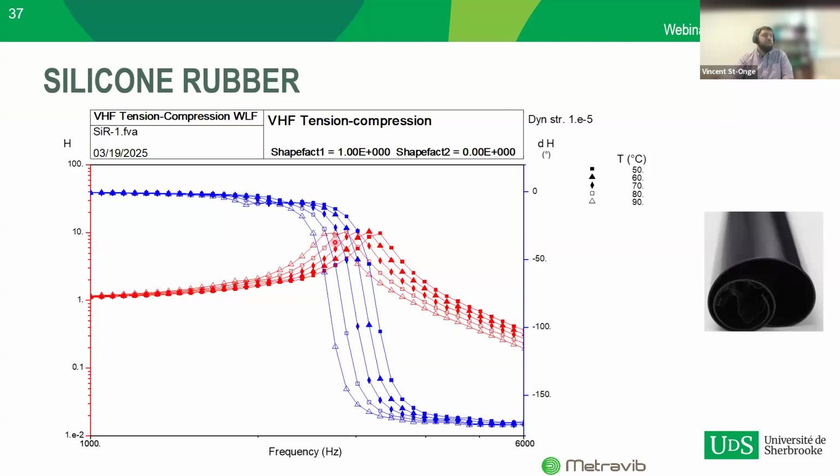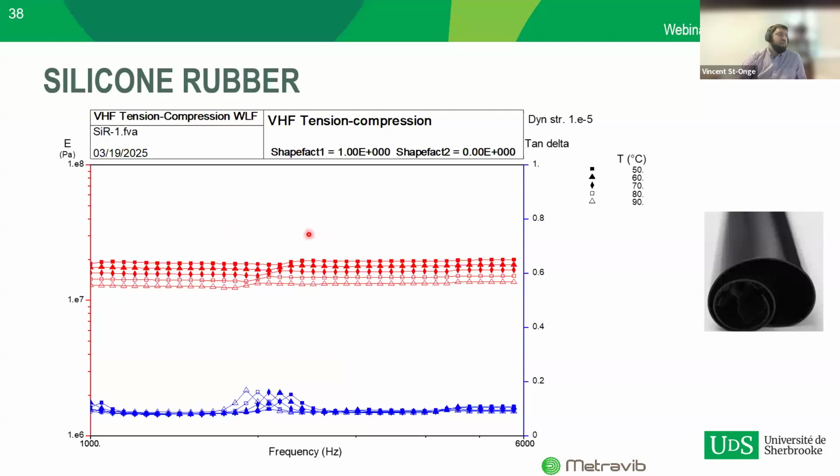So if we take a valid range, this is what the curve looks like. We can see here on the phase curve that there is a little dip going on here. And so when we do the modeling to get the viscoelastic properties of the material, we can also see this little dip happening at those frequencies, and it gives rise to a peak in the tan delta curve, which can be due to different effects or different things going on in the material. Without knowing the exact formulation, it's actually quite tricky to try and assess what it was, but the client was quite happy to see those peaks. So whatever they were, they were to be expected.